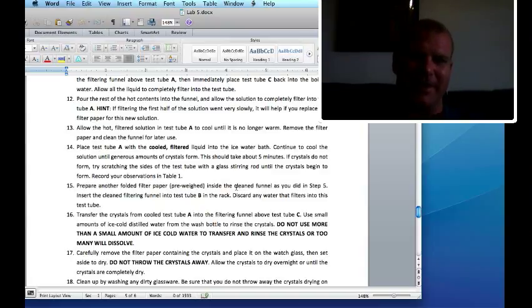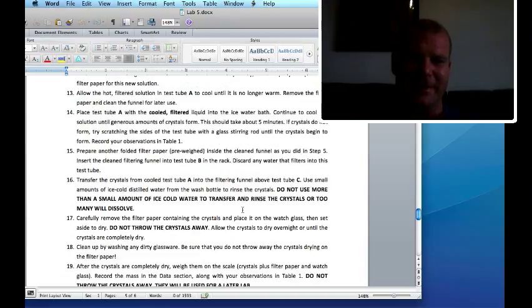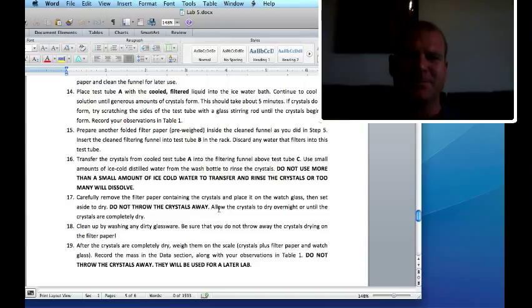Still use the ice water bath. Don't just throw it in the freezer; it'll take forever. The reason is that it's gas in the freezer, so it's going to take a long time to cool. In ice water it takes like 5 minutes to cool down, but in the freezer it takes an hour or more. If it's taking a long time, take your glass rod and scratch the surface. It just provides a surface for the crystals to form.